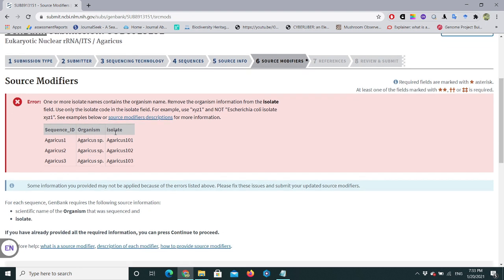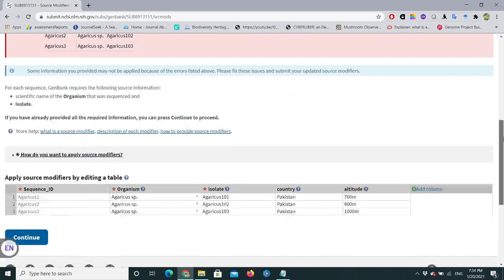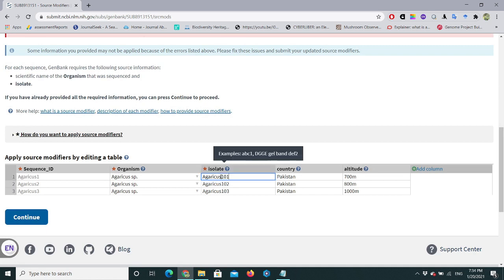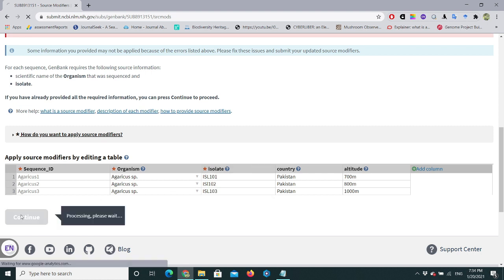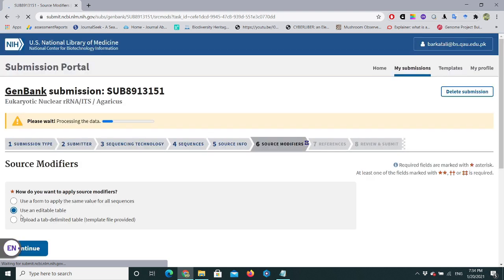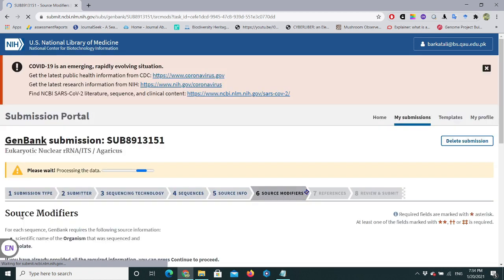We got another problem: the isolate field contains the organism name. We need to remove the organism name from the isolate field. I'll correct this by changing the isolate values to lab codes such as ISL so they no longer duplicate the organism name.